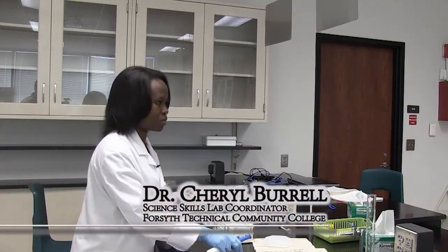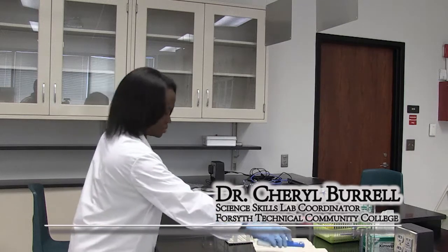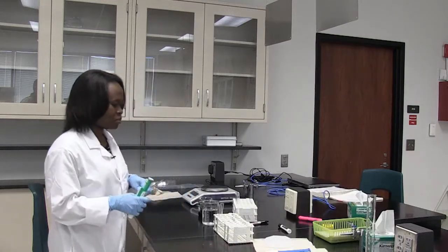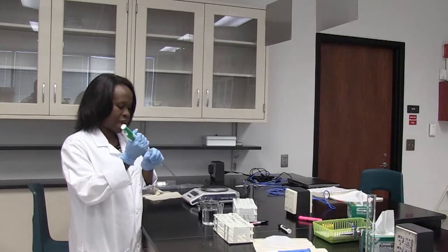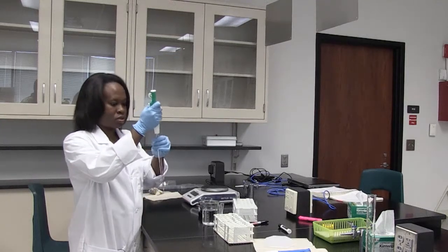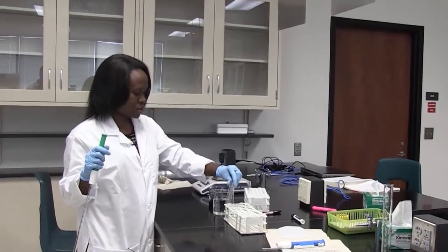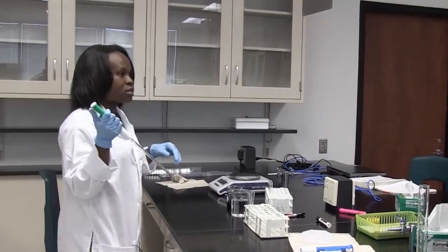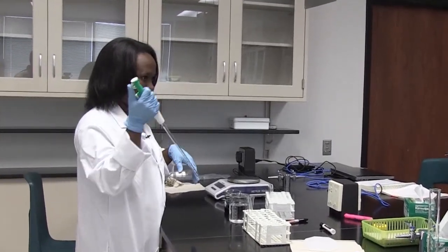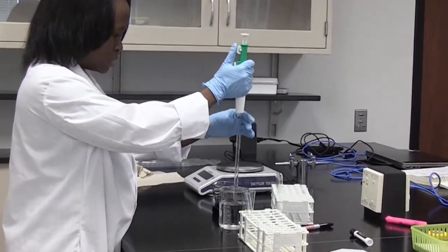This is how we're going to make our dilution series. We're making a 1 in 10, a 1 in 50, and a 1 in 100 dilution. The first thing we're going to do is add water to our test tubes. We're using three test tubes to make our three different solutions. The first one requires 9 ml of water, so we measure that and put it into the first test tube.